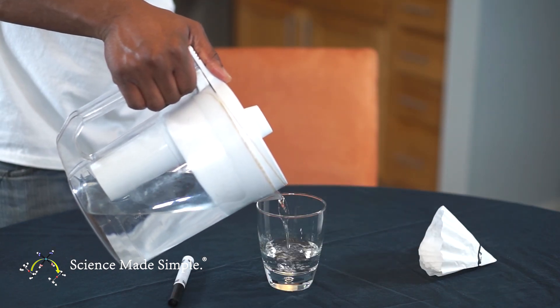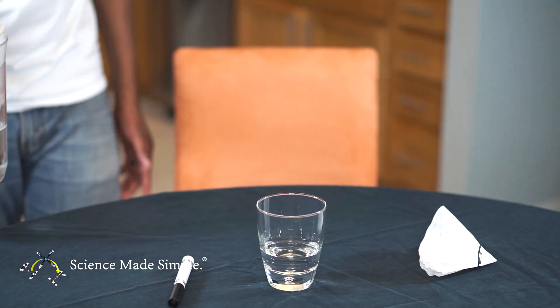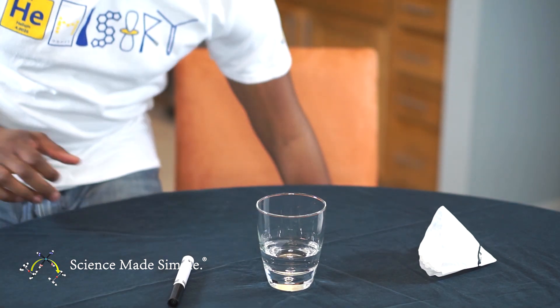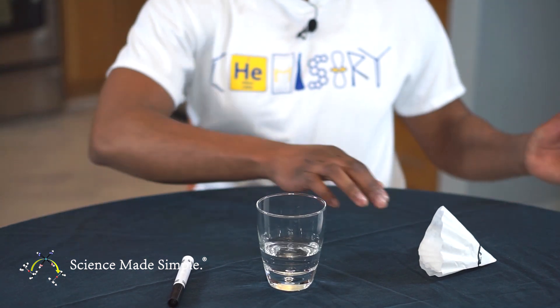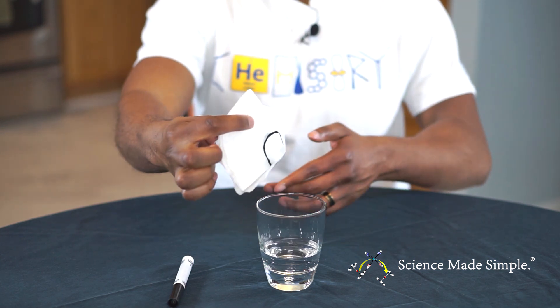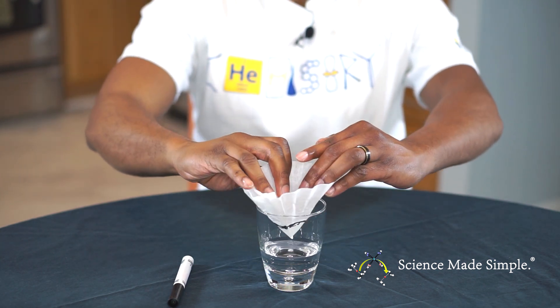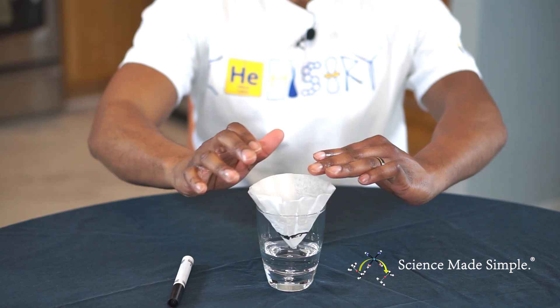Pour just enough water into the cup so that only the tip of the filter touches the water. Open up the filter so that it sits by itself in the cup with the tip touching the water. Be careful not to allow the marker line to go into the water.